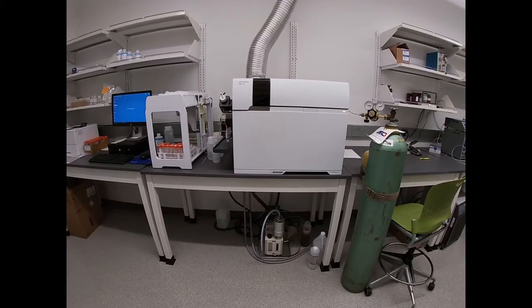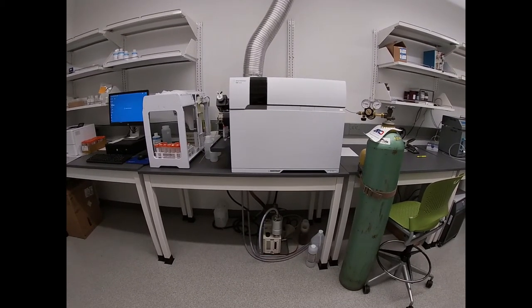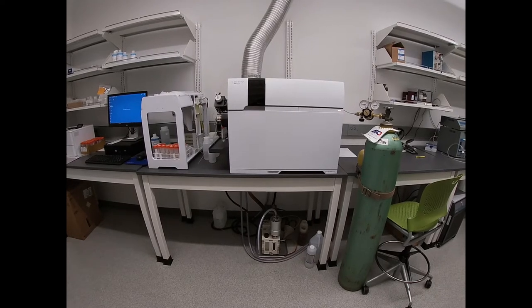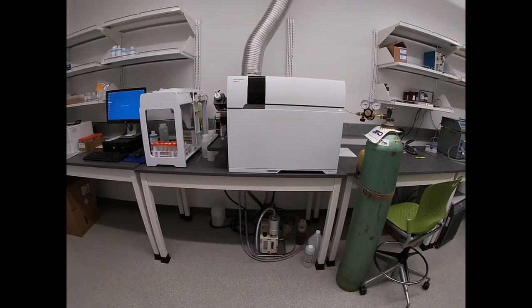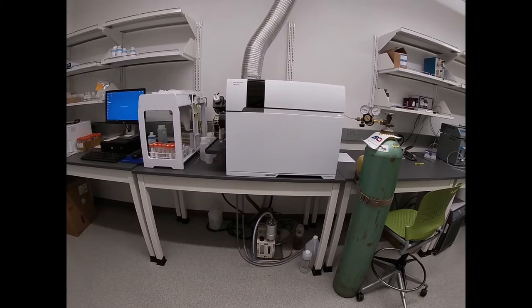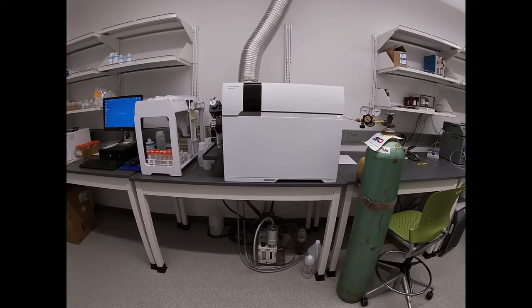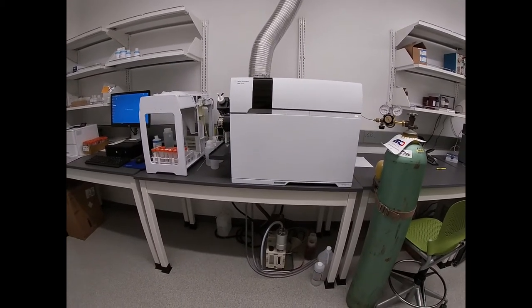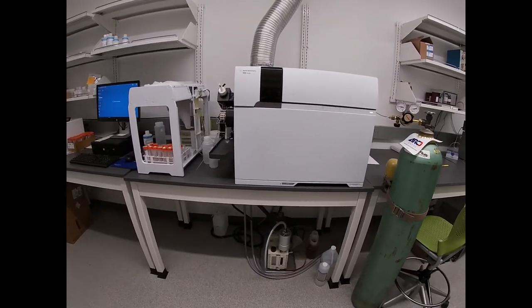All right, so today I'm here to introduce you to the Agilent 7800 ICP-MS system. This is for trace elemental analysis, ultra trace, down to really low concentrations. So let's begin.